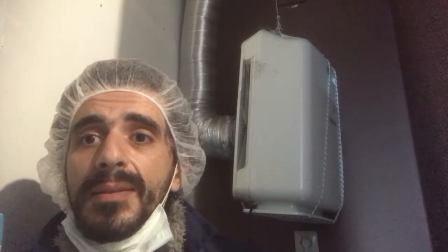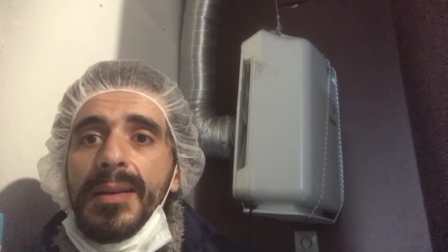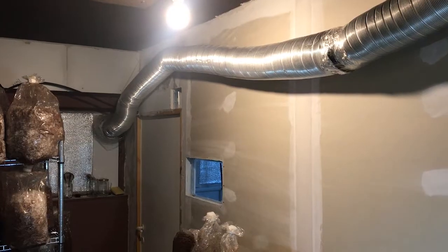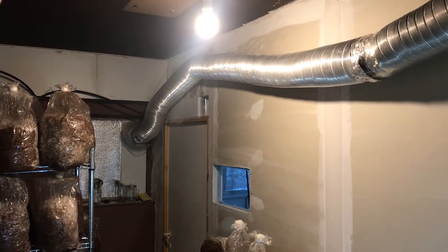I will start by showing you the pipes that are connected to it. These pipes come from the window and go all through the lab like this, ending up here connected to the HEPA air cleaner.